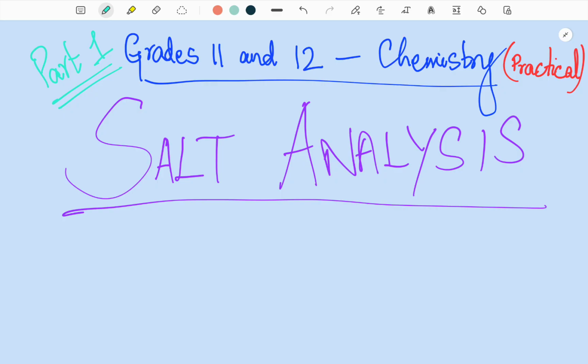In this video, I'm going to explain the topic salt analysis. This is a very important practical experiment in grades 11 and 12 chemistry. And in the board exam for the grade 12 students, salt analysis carries 8 marks out of 30. So it is very important that you learn this experiment very well.